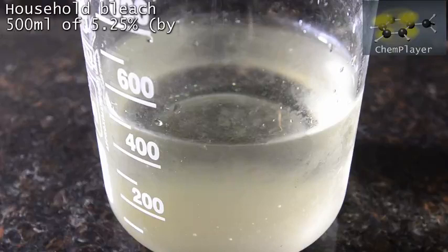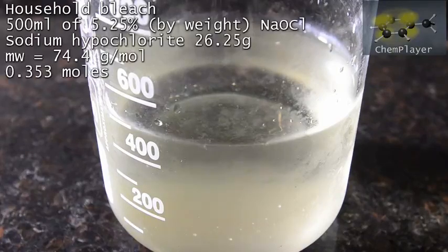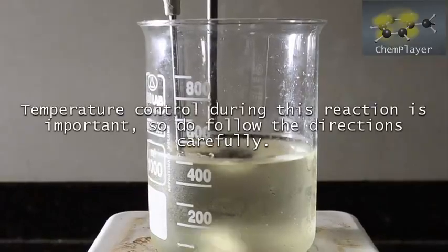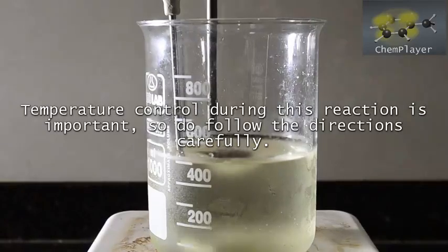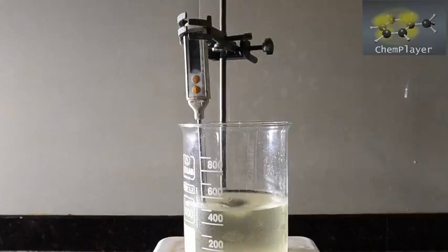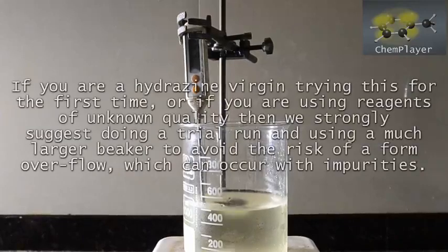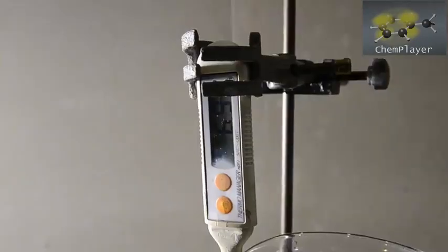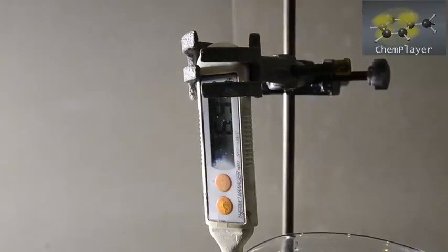We're starting with 500 mils of 5.25% sodium hypochlorite bleach. Get the cheap watery stuff with no thickening agents or detergents in it. We placed our bottle of bleach in the fridge for a few hours to get it nice and cold, and now we've transferred it to a large 1 liter beaker with a large magnetic stir bar in. Temperature is at about 7 degrees C, so nice and cool.